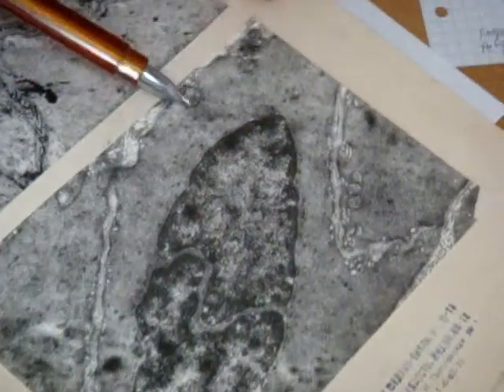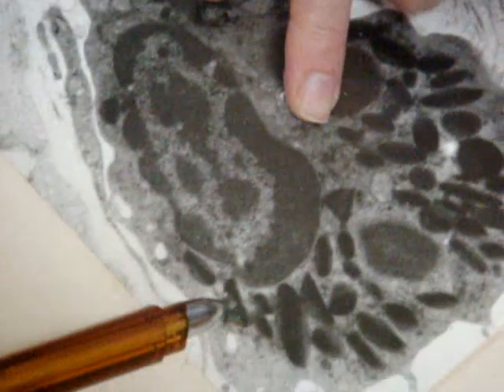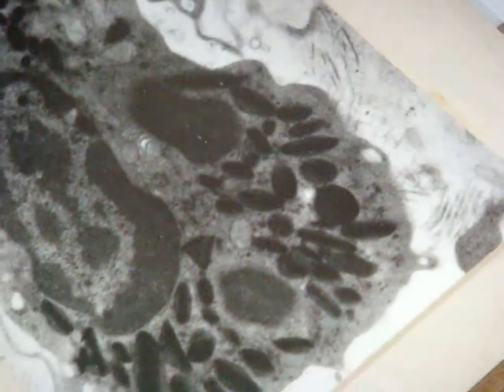This is also a smooth muscle cell, nucleus, this is all actin. Dense bodies, mitochondria, and what is this? Caveola. And this is what? Eosinophil. Why? Because if we look attentively, we can see a dark crystalloid inside each granule. Such granules can be found only in eosinophils. That's all.